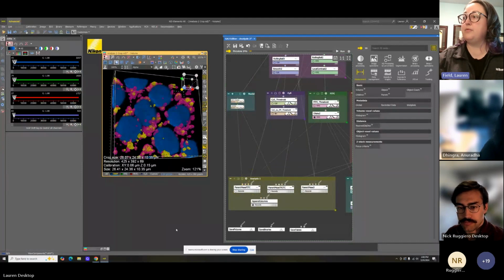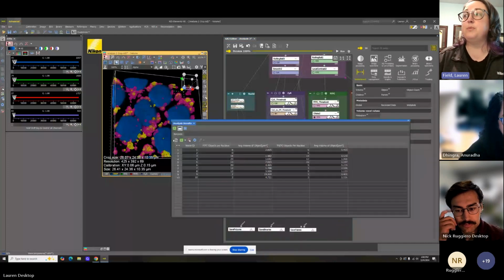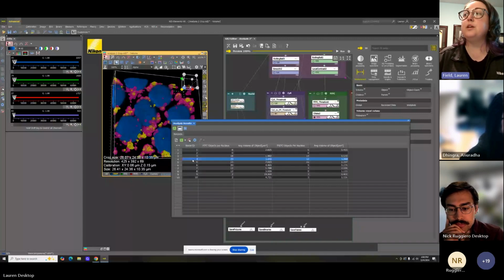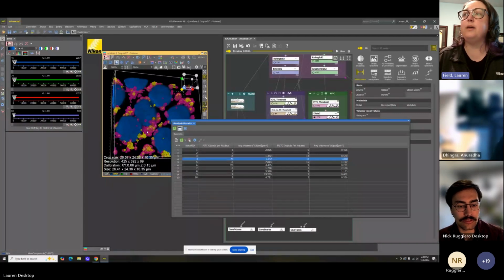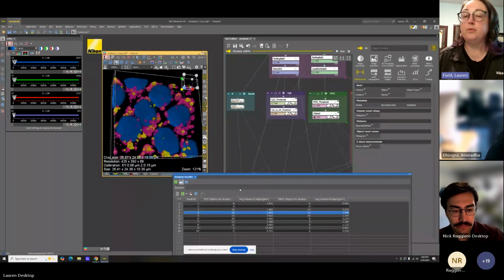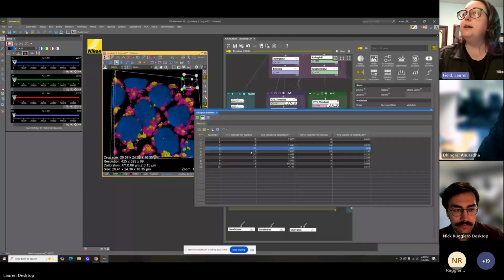When we get these types of records, we end up with something like this, where we'll have information per nucleus. One of the things that we have found is with two cells next to each other, in the help file, it describes how it's deciding what the nearest neighbor is, and I don't know that math off the top of my head. But that is a great point. It should be easily accessible when you click on the help file, and there are some pretty nice walkthroughs in the help file of parent-child relationships, because this is something that I think a lot of people are interested in.